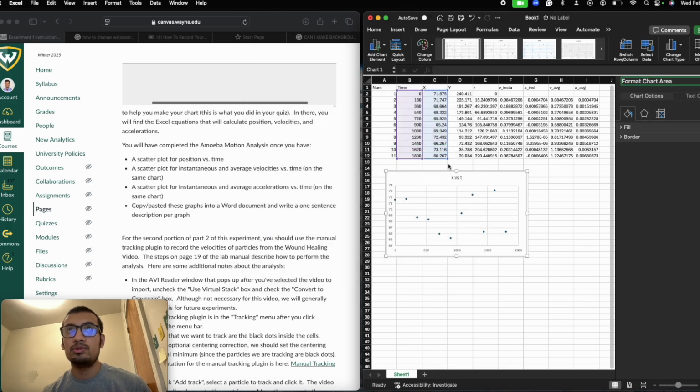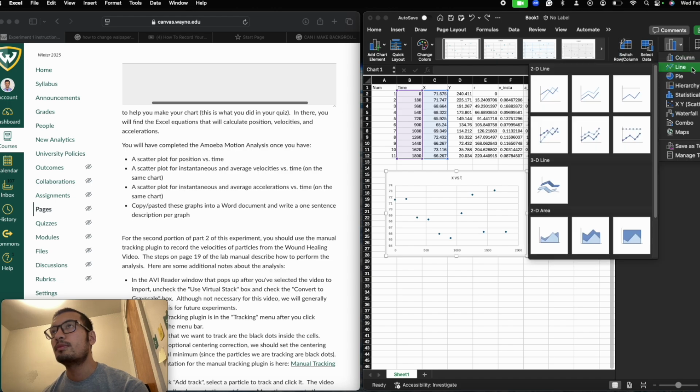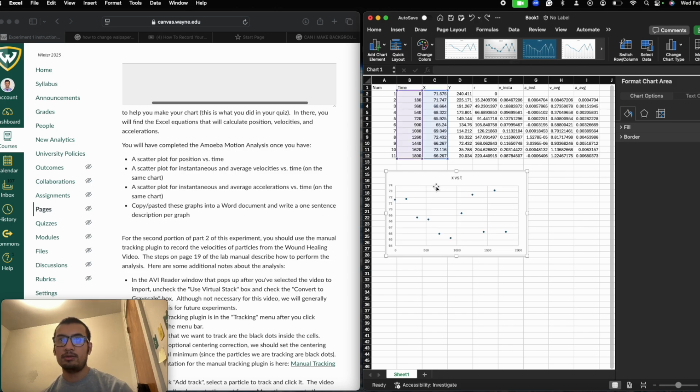Yeah, so you select this one, change chart type, line, and then yeah, nice. So yeah, we got this.